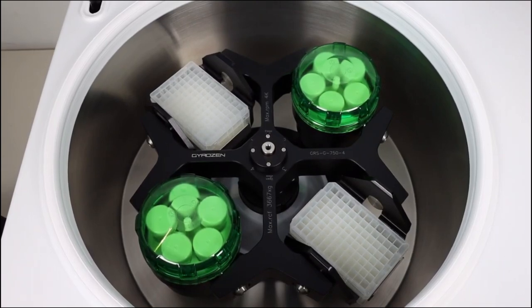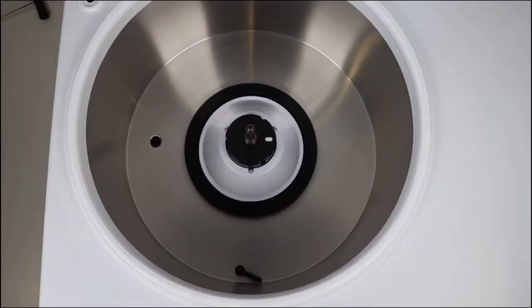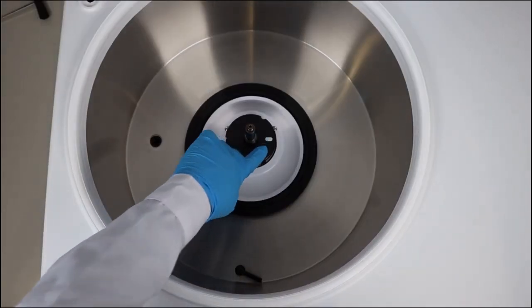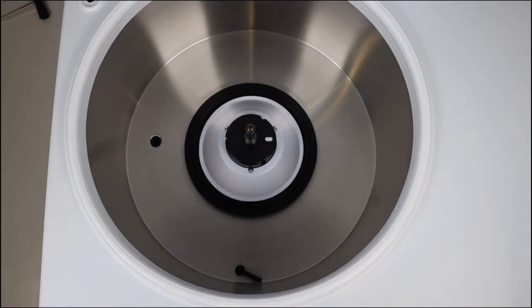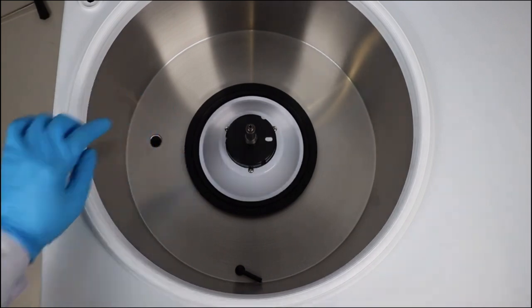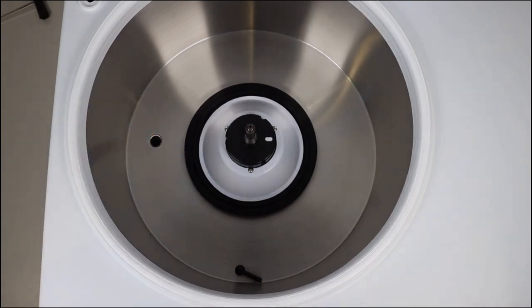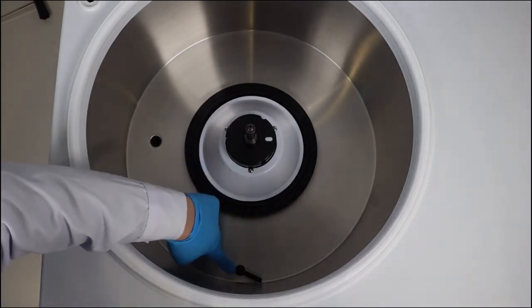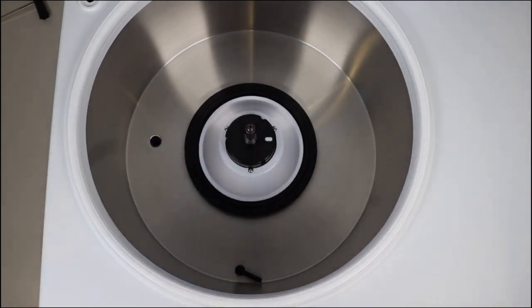The set RPM is within the limit of the rotor. Inside the chamber of the instrument, you can see the RPM sensor, which is also used for rotor recognition, to drain out all the liquid after the run, and the temperature sensor for actual temperature inside the chamber during the run.